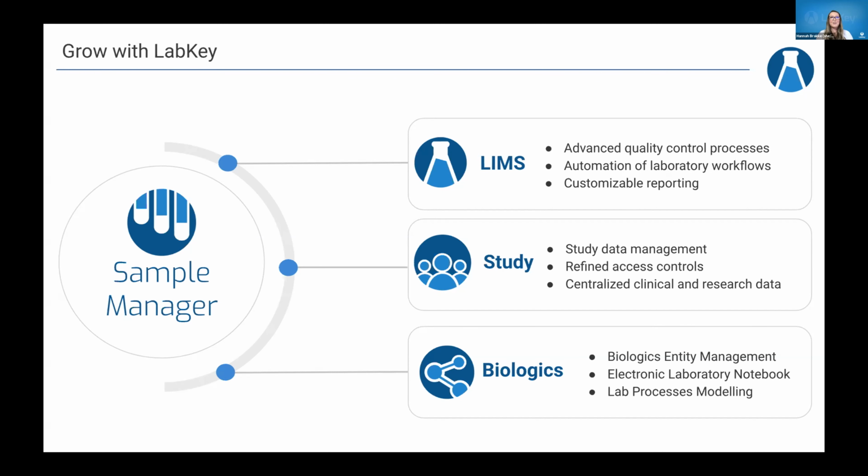And then biologics, which you heard a lot about yesterday. Some of you might be asking why what you showed today is a lot of what biologics has, and that's really intentional. We want you to be able to use the tools that Sample Manager has and then expand on them if you are doing large molecule biologics development. So that entity management Bernie talked about, having an ELN that tracks with that data, and of course the lab processes modeling that he's going to be working on this year and next year.